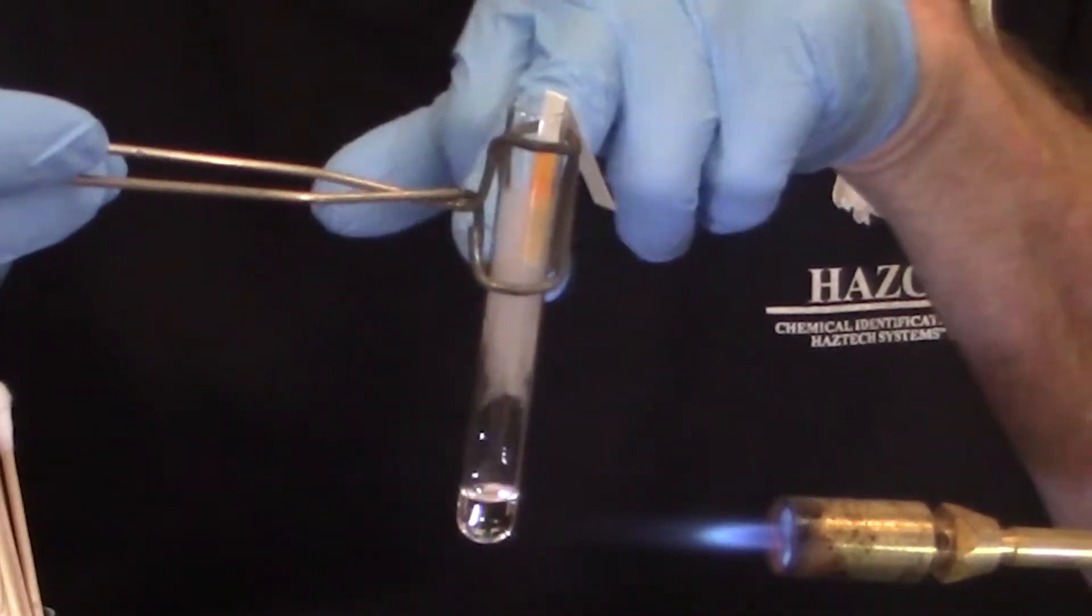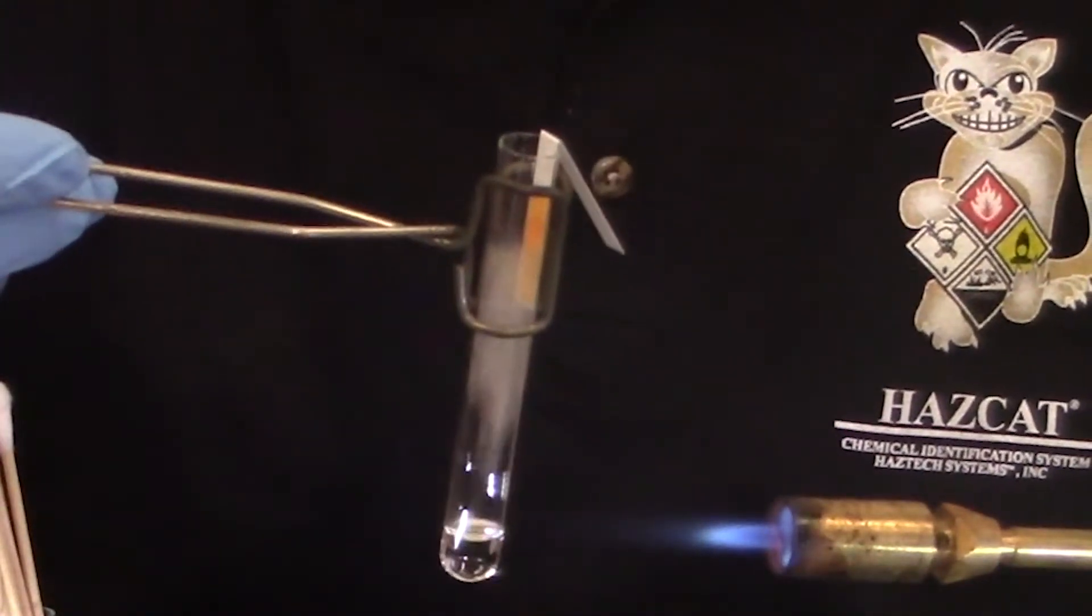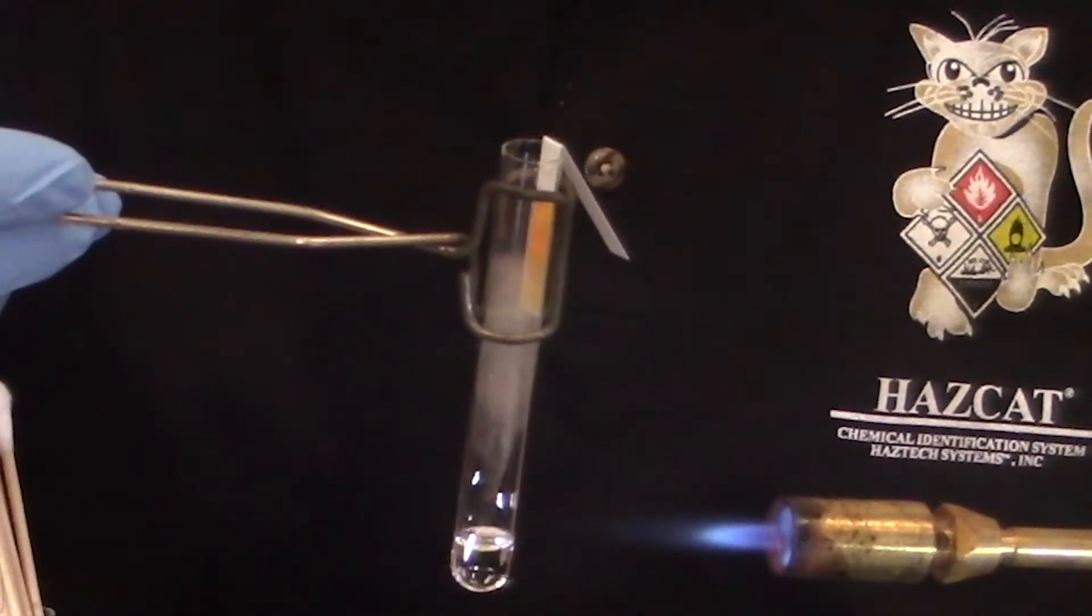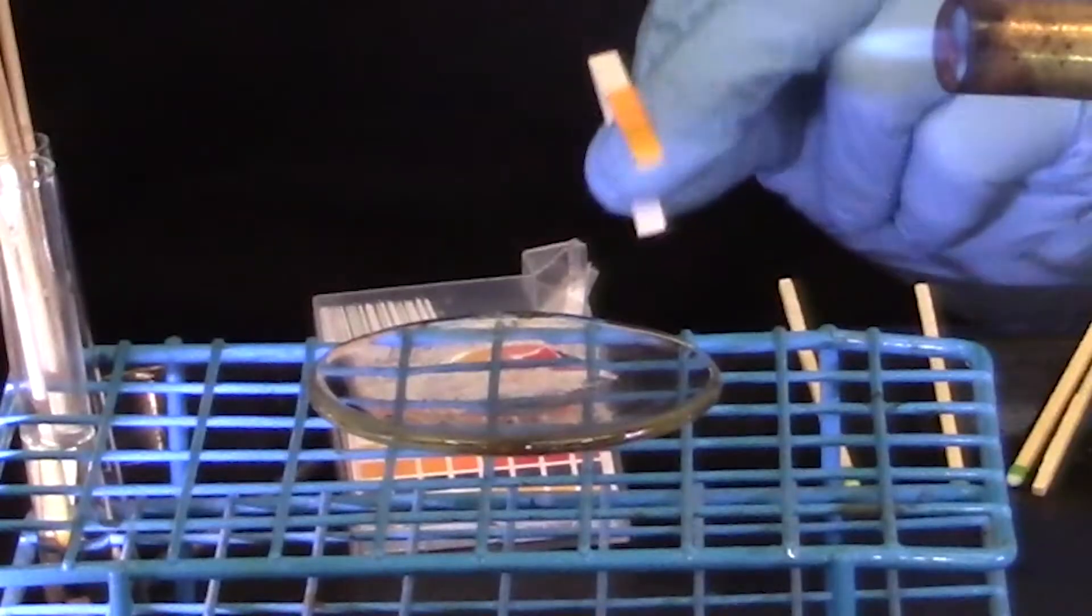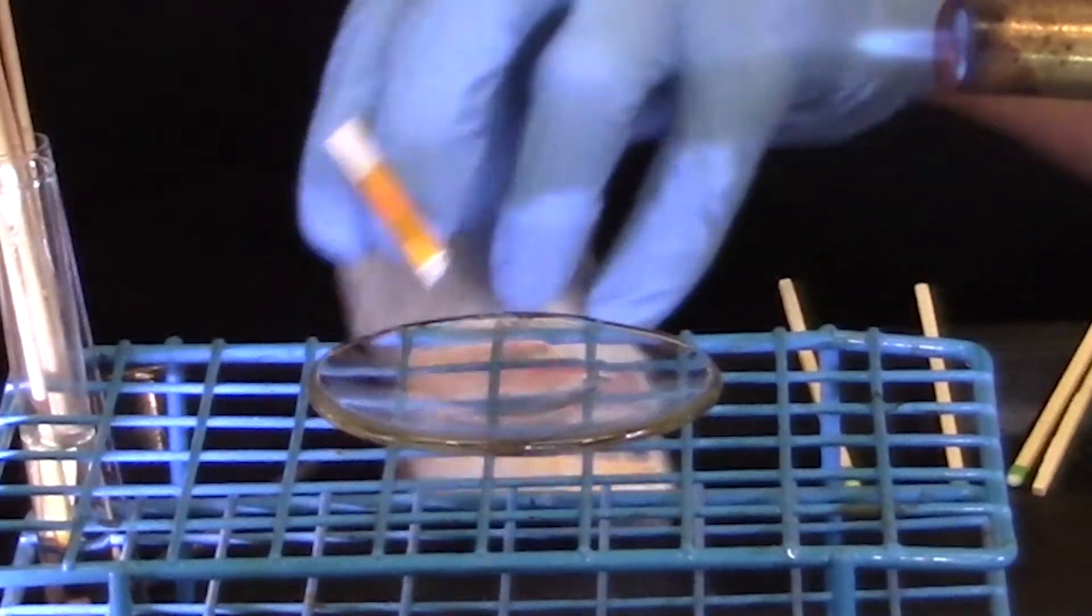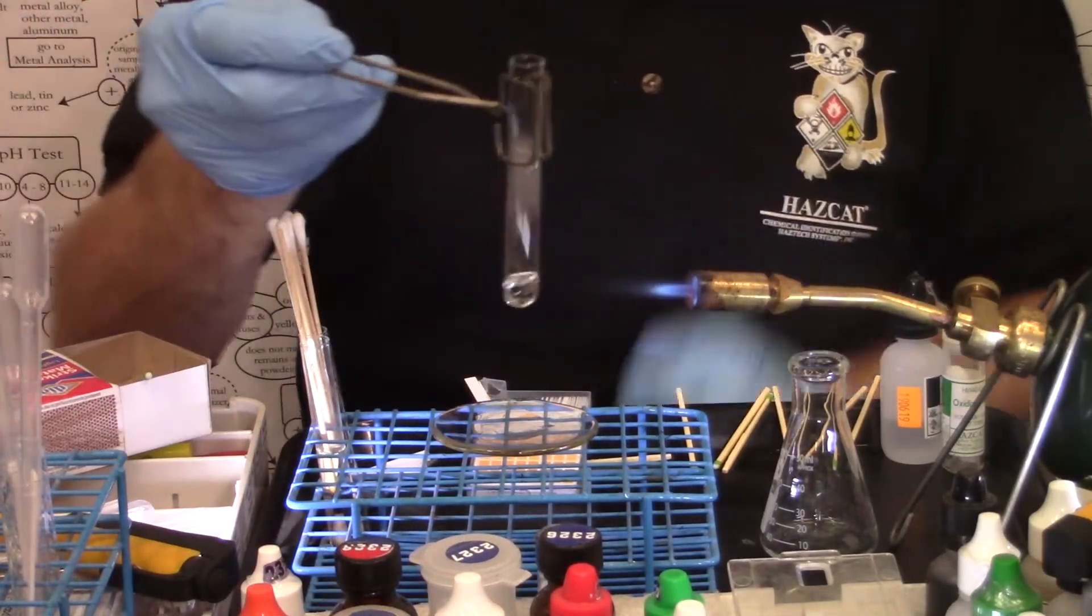Once I get a few vapors, I allow the pH paper to sit in the vapors for 10 seconds. I'll take the pH paper out, read it, about neutral, about a six, let's say, and then continue on.